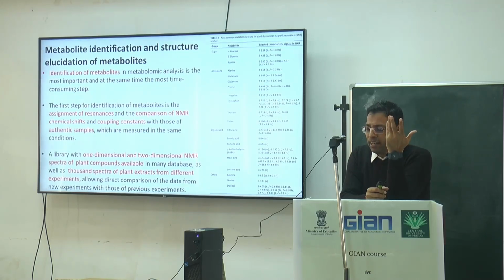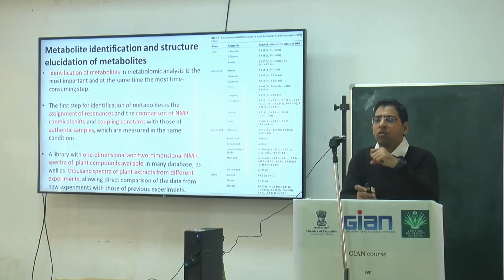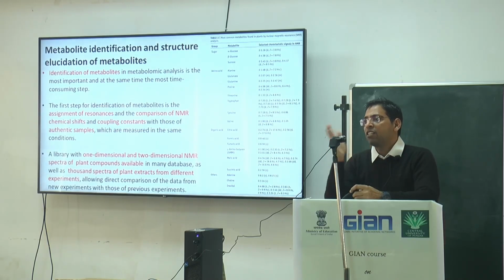Many people are selling herbal medicines and many other things. One thing I know is a rock mineral, shilajit, where you will find 95% adulteration. Second is saffron, where 95% is a chemically synthesized component. How do you differentiate them? If you know the authentic saffron, you will get a different kind of mix, and you just do the NMR spectra. You can say whether this sample is authentic or non-authentic.